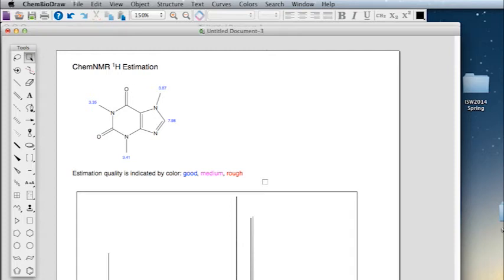As we know from NMR theory, NMR signals, specifically the chemical shifts, can vary due to a number of outside factors of the sample conditions, such as temperature and solvent used. Most chemistry software that predict NMR spectra follow a general and basic sample conditions, and ChemDraw is no exception. Therefore, often we find that these NMR predictions may not be representative of your sample that you synthesize because your reaction may be carried out with different conditions or solvent systems.